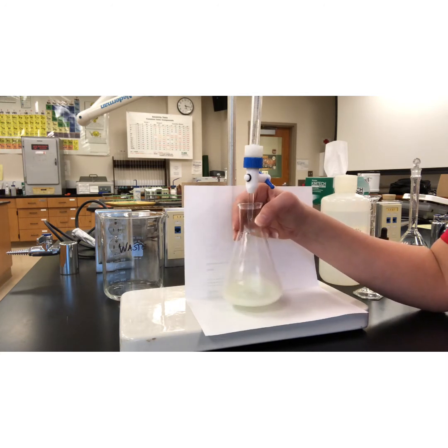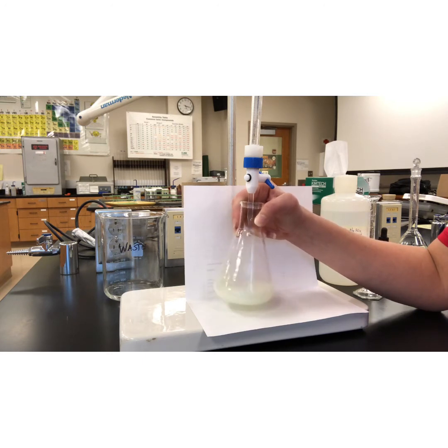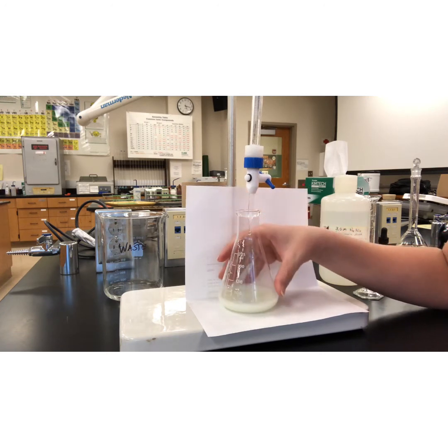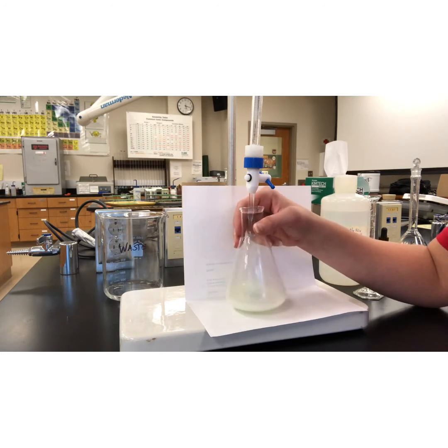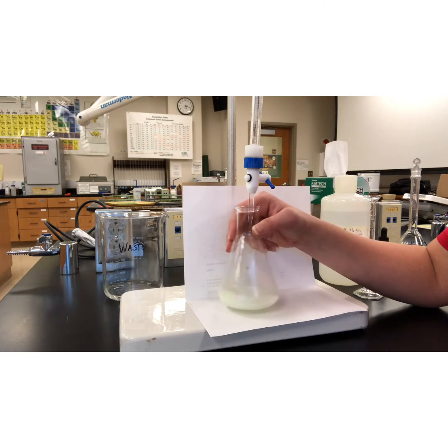Swirling. Sometimes, if you have enough solution, you can do a really quick titration and get a really rough estimate. So you can do a more accurate one next and save yourself some time, I guess. And get a rough estimate of the change of volume it takes to reach the end point of your reaction. I feel like I'm really close, so I'm going to tough it out. I'm not going to do that.